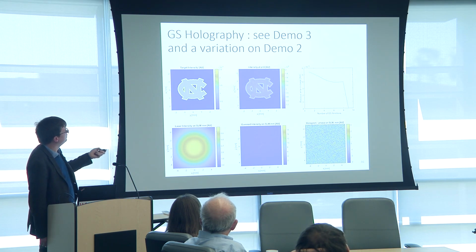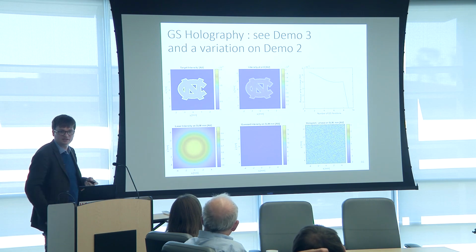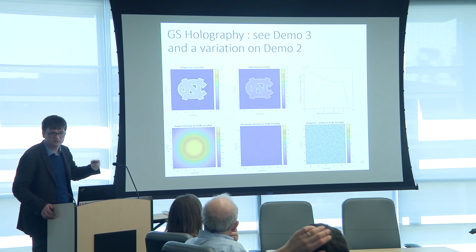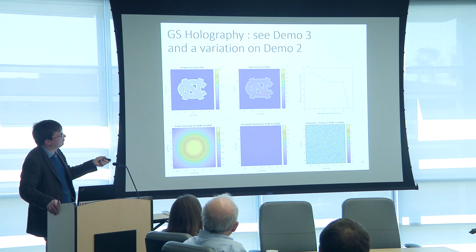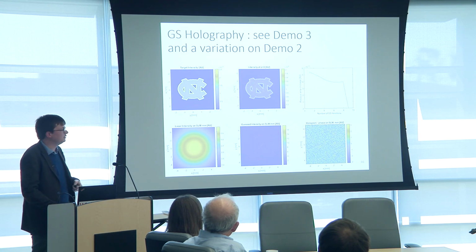Yeah, this is an example. So here we have a certain target intensity. So this is what we want to draw. And we have a certain intensity profile. So this is a Gaussian illumination on an SLM. And if you apply this phase pattern between minus pi and pi on the SLM with this amplitude profile, after 10 iterations, you will be able to recreate this image. So the code runs iteration after iteration. You'll be able to see the quality of your hologram go up. And this is the residual error, which is 1 minus the accuracy. And you can see that this converges to a decent hologram and may be satisfactory for your application.